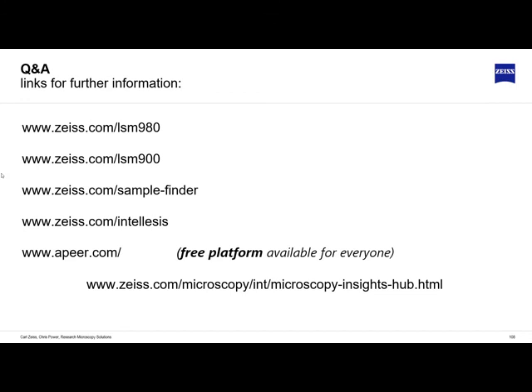The second part is we apply a Wiener filter, which is a simple denoising filter, in order to improve the resolution a bit further. You can go further and get into deconvolution if you want to squeeze that a little bit more, but that's probably a bit much for today's talk, and it becomes a case of diminishing returns and being careful for artifacts. So the main algorithm we use in terms of the Sheppard sum and Wiener filter, we know we can do artifact free and very, very quickly.